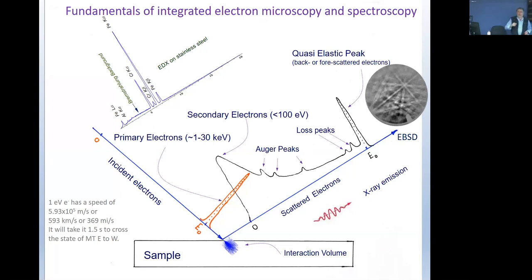So these are taken with high energy electrons here, 20 keV. What you do is you tilt the sample about 70 degrees, so the beam comes at 70 degrees to the surface. This is essentially grazing. The reason for this 70 degree tilt is that you want to probe the surface, maybe about 5, 10 layers.